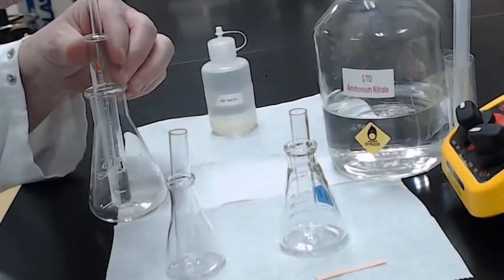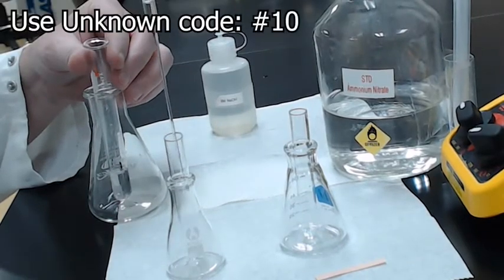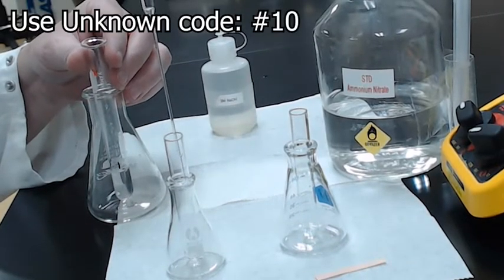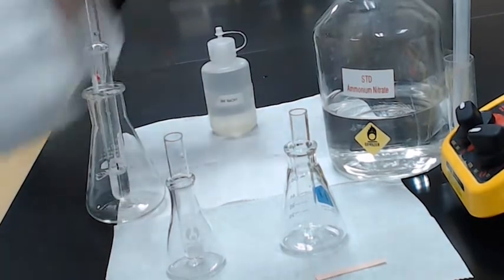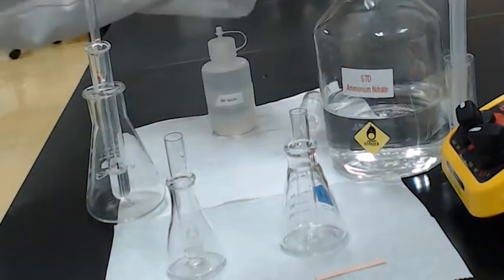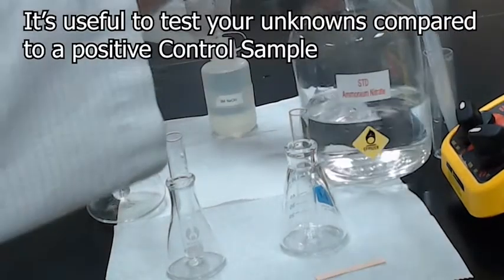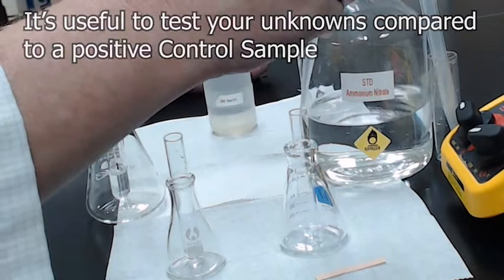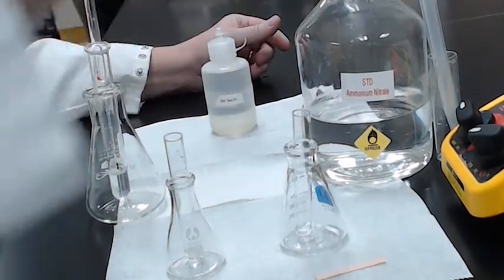We're going to add 5 drops of the unknown to the bottom of this test tube, and we're going to compare it side by side with 5 drops of the ammonium standard, so we can have a side-by-side comparison. Again, it's important that you do not touch the top of your test tube.